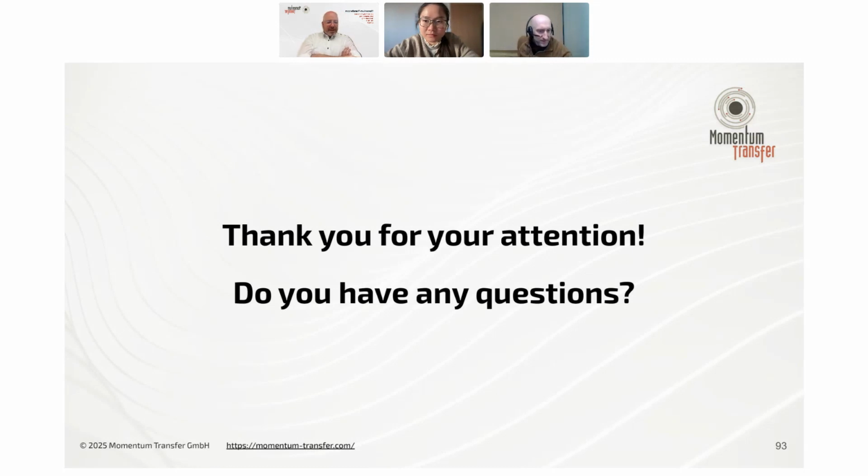So I think that answers part of Adrian's question, because he also asked about the XRD phase identification tool. By the end of January, we should have a beta version released for you to play with. Register on the site to get access, and if you have not measured your data with us, send us samples now, and you can use our tool right away for that. We'll make another announcement once it's released, just to let you know that it's there.